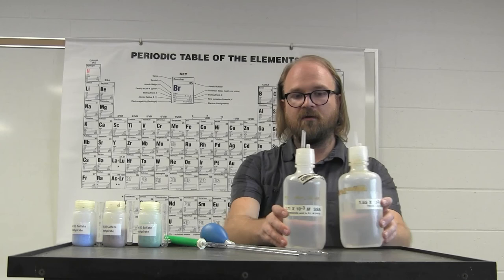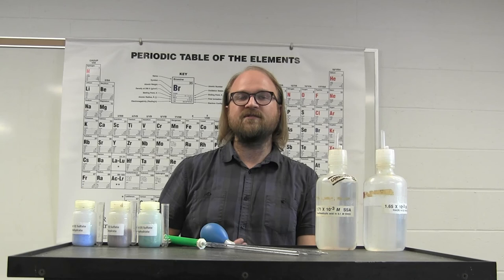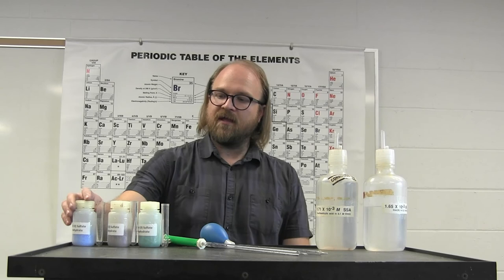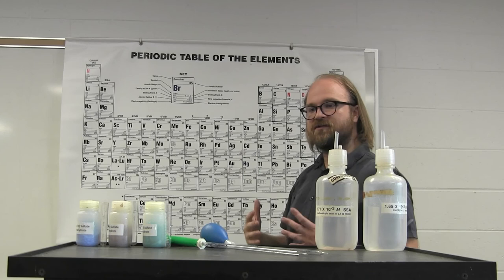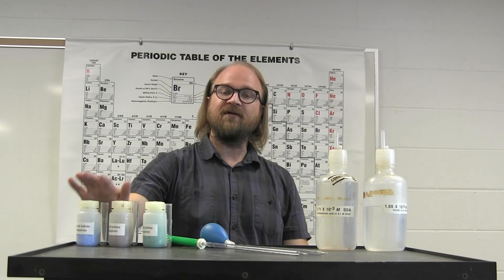You're also looking at preparing a few different solutions of different sulfates. Everyone is preparing a solution of aluminum sulfate, which is colorless, as well as a solution of a different transition metal sulfate, either blue copper sulfate, red cobalt sulfate, or green nickel sulfate, and weighing out a specific mass, using the mass and its molecular weight to determine how many moles of the different compound you weighed out, using the ratio of the moles of the compounds themselves.